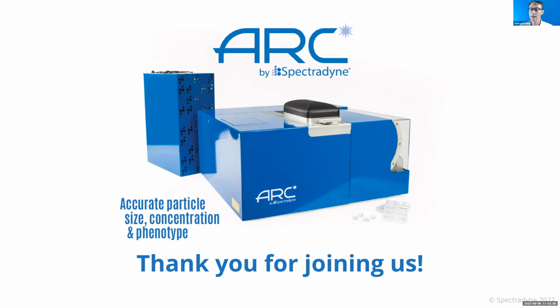I see Dr. Jones has her hand raised, so let's. Yeah, Edwin and I are familiar with this swarm problem. Right. Before Edwin popularized the term swarm, flow cytometry referred to part of that problem as coincidence.